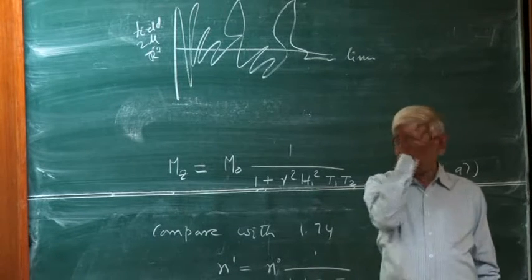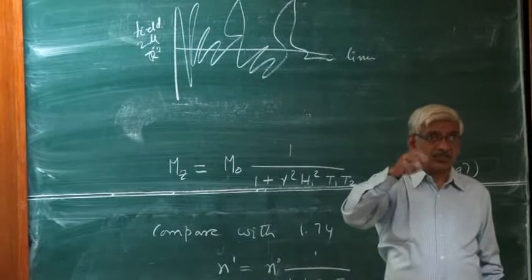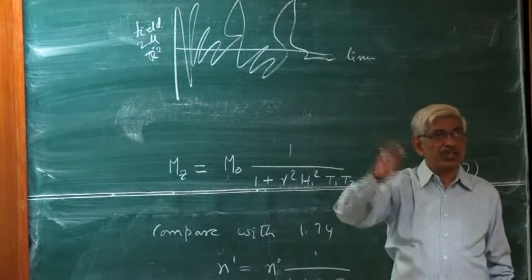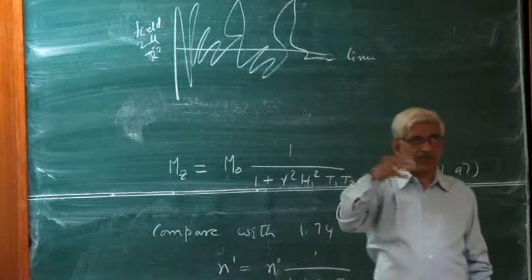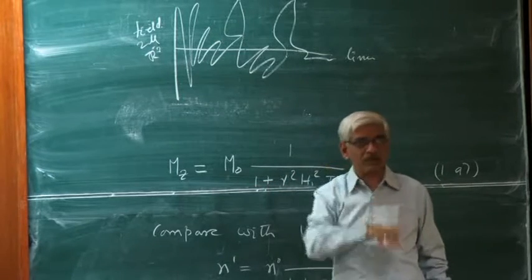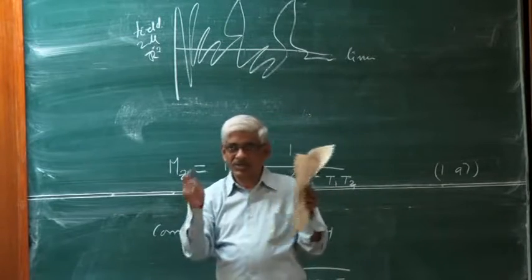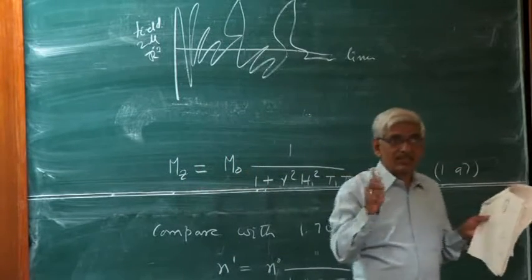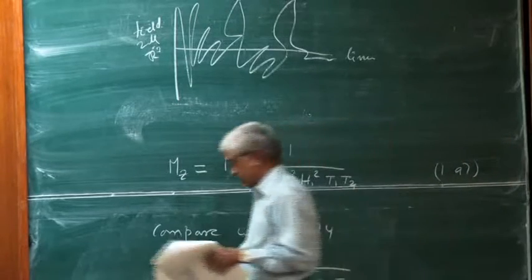No, not cancel out. They will all contribute to the field there. They will all contribute to the total field value. Therefore it is random fluctuation. Different ones will contribute differently, so it is a total addition. We will come to that, that is why it is called spectral density. Take an ensemble average. But first try to get the concepts of why these things are happening, and how these things are causing transitions.